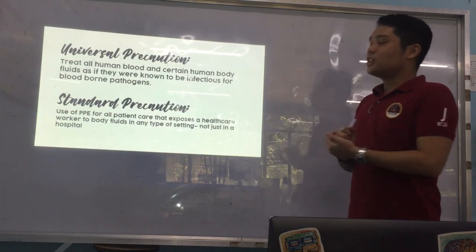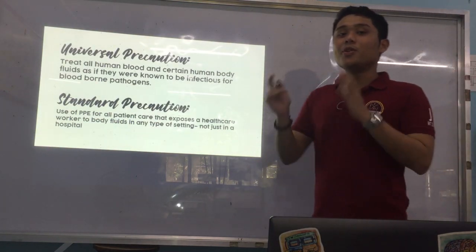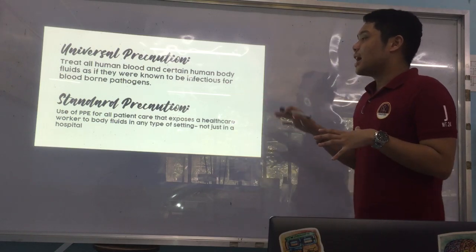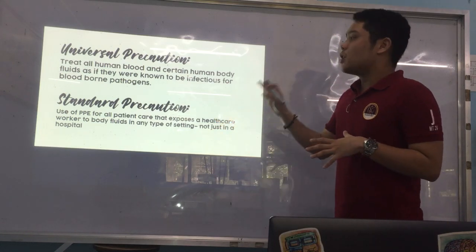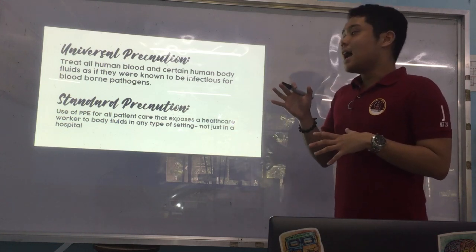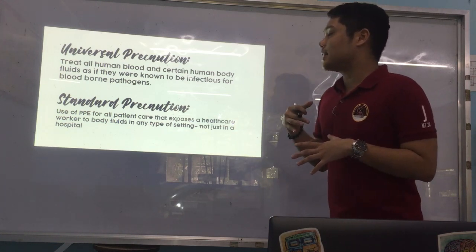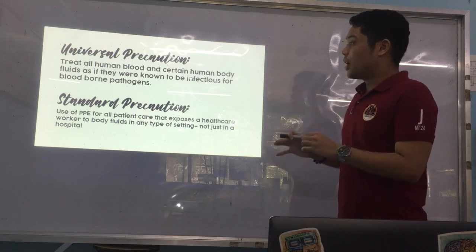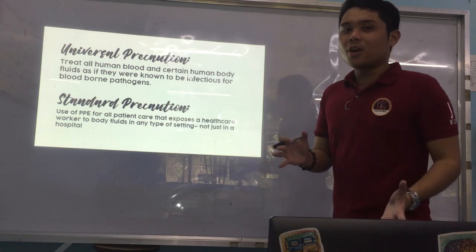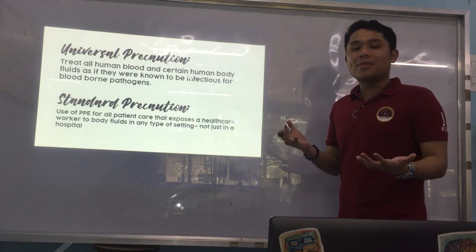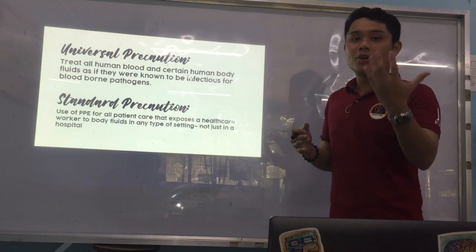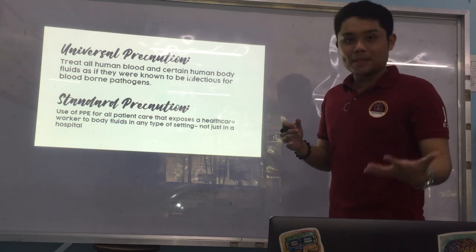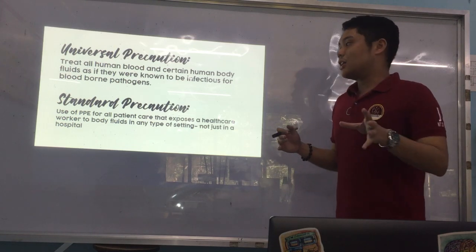Our first part is to differentiate between universal precautions and standard precautions. According to universal precautions, we should treat all human blood and certain human body fluids as if they were known to be infectious for blood-borne pathogens. Examples of blood-borne pathogens include HIV, hepatitis B virus, hepatitis C virus, and others.